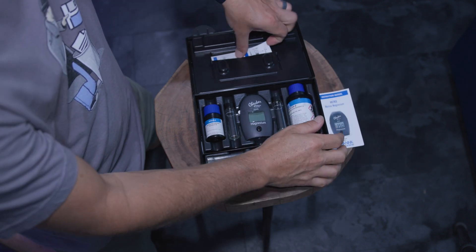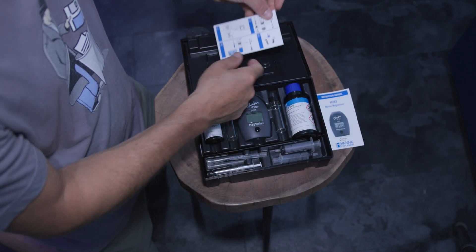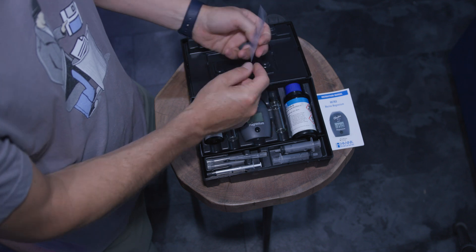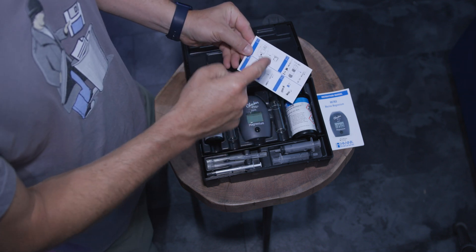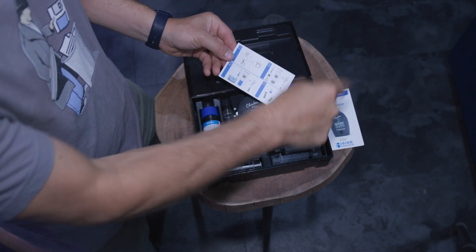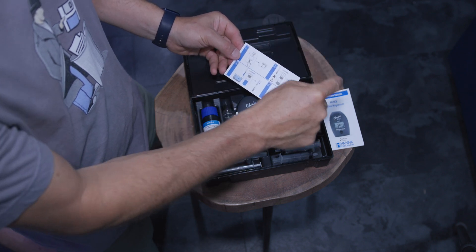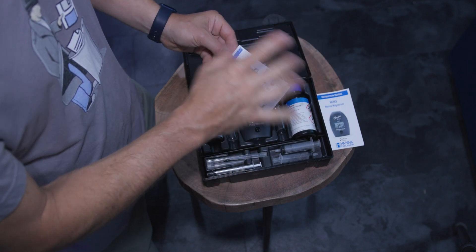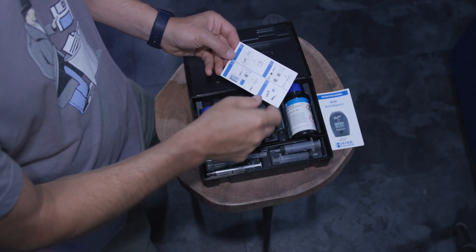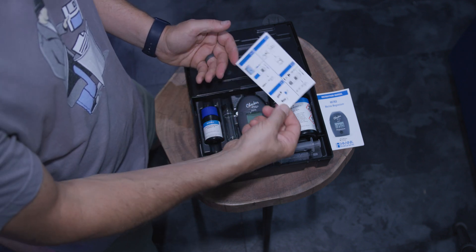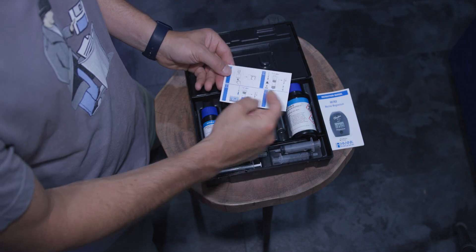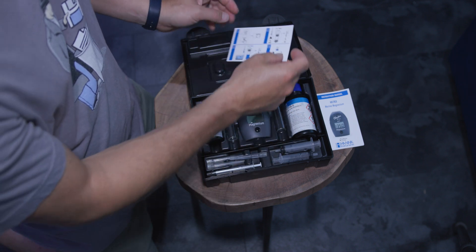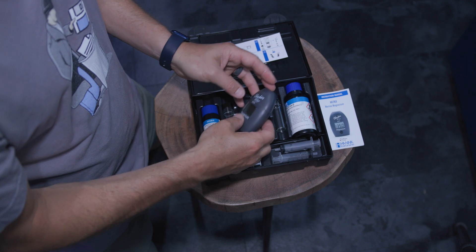I like that there's this little place to hold things. Then, we have graphical instructions. I like these things. I'm going to read the instructions likely the first time. Then, I'm going to follow this. Okay, let's be honest. We're just going to look at this, but this is great. You start looking at stuff. You need a quick reference. These graphical instructions are really cool. Let's use them and see what we can get going.